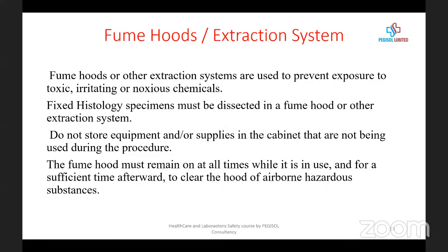So fume hoods are used for extraction systems. There are different extraction systems you could use to help you take the air and those fugitive, hazardous chemicals out of the workspace.